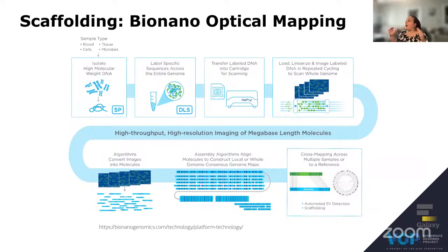Another type of high distance data that we can use, I'm not going to show you the workflow today because we're going to use a simpler version of the process, but we also can use BioNano optical mapping data. So optical mapping is highlighting probes across the sequence of the DNA, whose sequence we know. And so we see these probes that we know are separated by this number of reads. So it gives us large scale information and allows us to organize contigs comparatively to each other. So this is also available in the data.